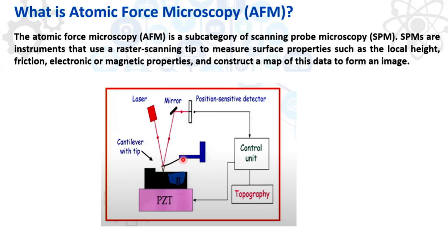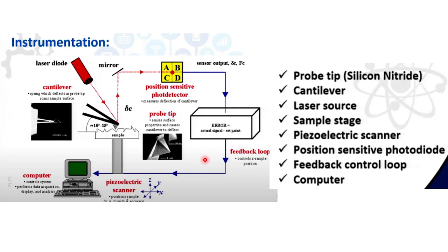So we have already read during our 10th or 11th standard that lever, how the force is changed. The same thing is what we are using here. Based on the force, it will bend. That's why we are using that cantilever. Here you can understand it more clearly.